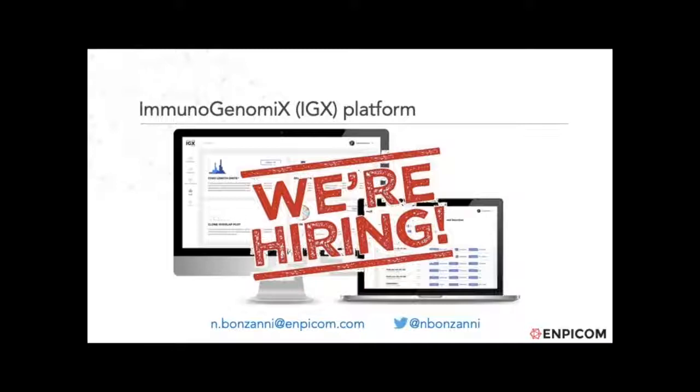Another case of external data is an external clone database which has been, for instance, annotated for specificity. If you can import that data inside the platform, then you can start making interesting queries, looking at which of the clones you found in your own studies match the ones already annotated in an external database.